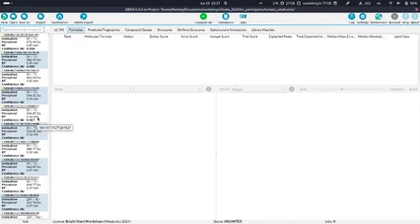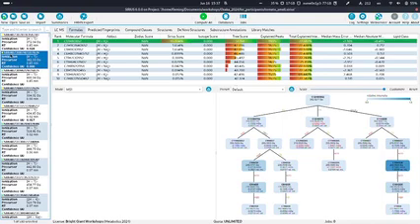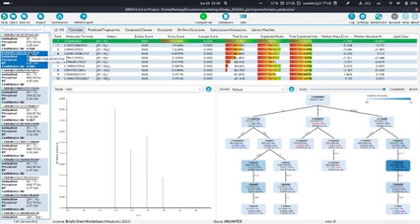And now we have everything that is pre-computed. One difference you will see here, actually I have not explained this very much: in the compound view, at the top, you have your compound name, your feature name. You have the ionization, which has been detected, for example by MZmine. You have your precursor mass. You have the retention time in minutes. As I said already, this list is by default ordered by retention time.